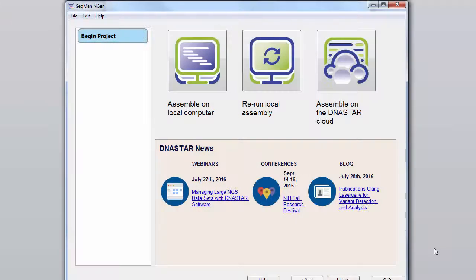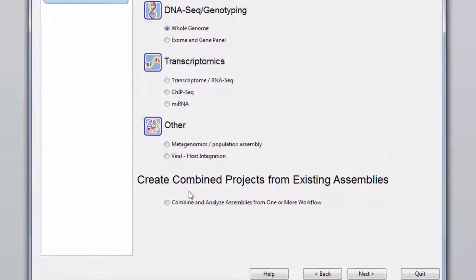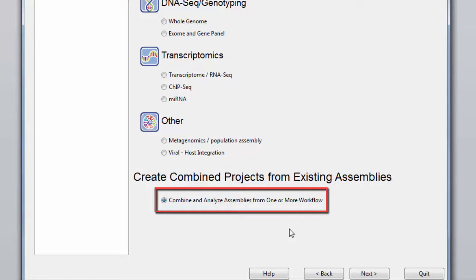To combine assemblies, start in SeqMan Engine. From the Workflow section, select Combine and Analyze Assemblies from one or more workflow.